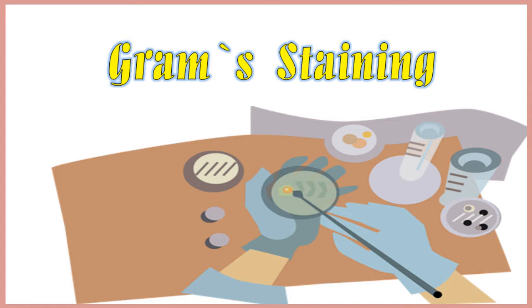In today's session, I'll be teaching one of the most important staining techniques of microbiology called gram staining.